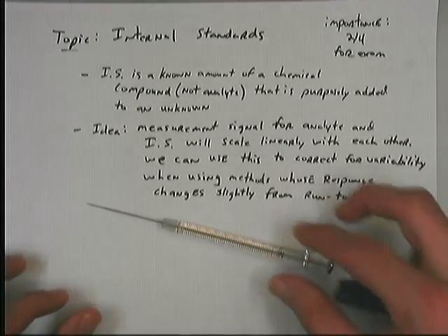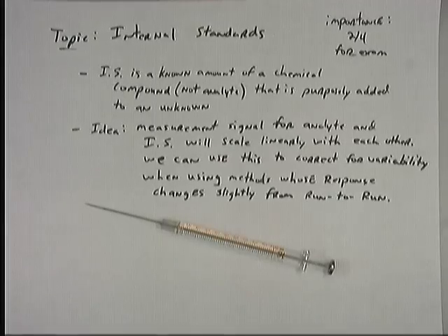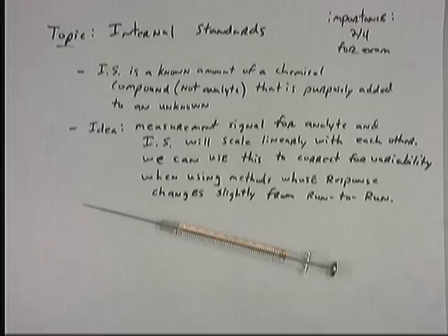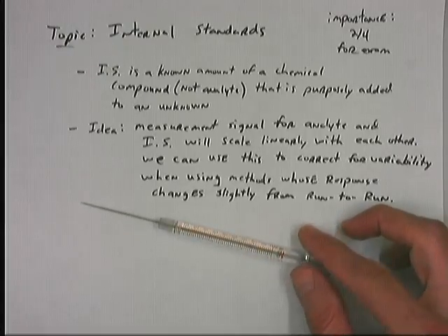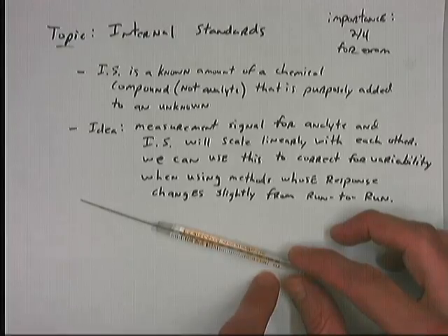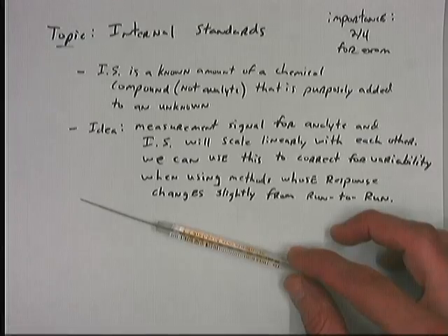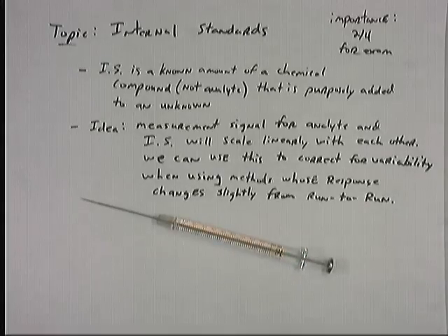And a common example of such a sort of subcategory of techniques, if you will, is in gas chromatography. In gas chromatography, you might use a syringe that looks a lot like this one, okay? In fact, it would be typical to use volumes that are smaller than this. This is a 100 microliter syringe. The whole thing can hold 100 microliters of sample. It's not uncommon to inject way less than even 10 microliters in GC, but the syringe would look the same. It would just have a slightly smaller diameter plunger, and the volume would be lower.